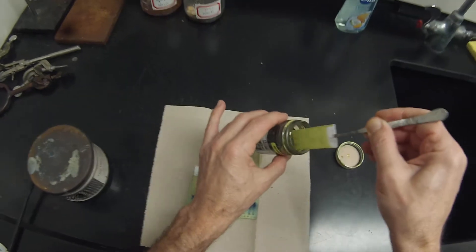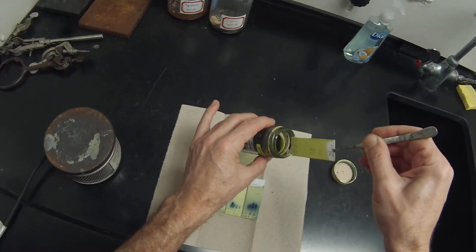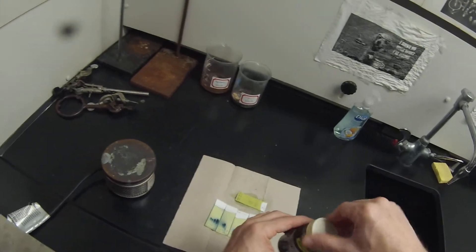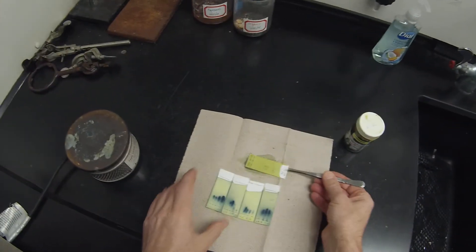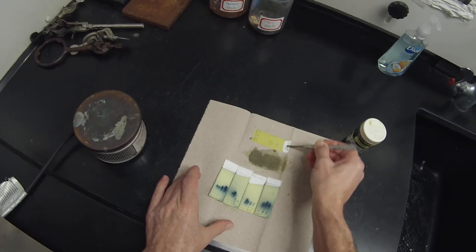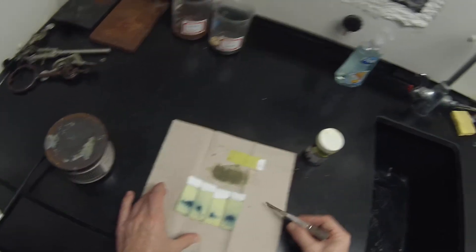Maybe we'll find out this is even a better solvent. Let that dry, put this back in the fridge. This stuff doesn't behave very well if you don't keep it refrigerated.